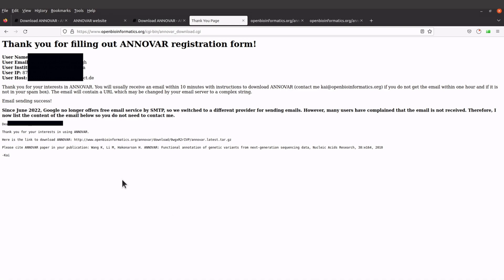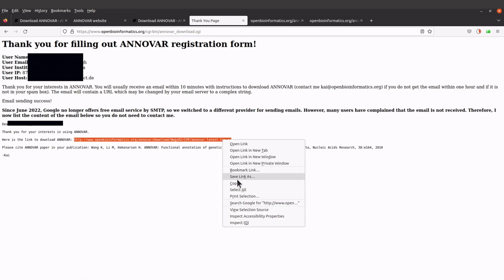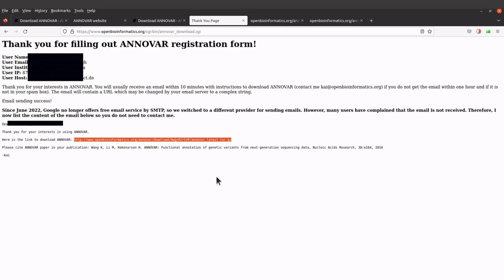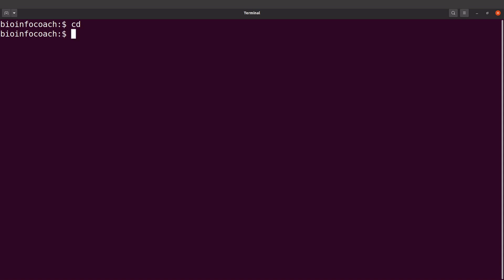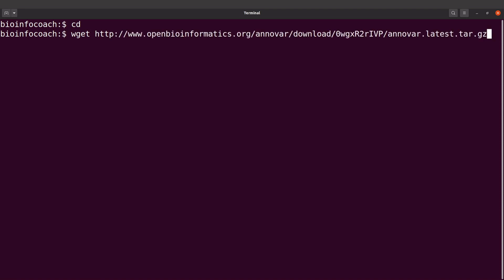Alternatively, you can also download the ANOVA software on the terminal. If you have the link, you can copy it and then go to the terminal and use tools like wget or curl to download it. On the terminal, I'll navigate to my home directory and then use wget to download the software, supplying it with the download link. I prefer wget but you can use curl as well.